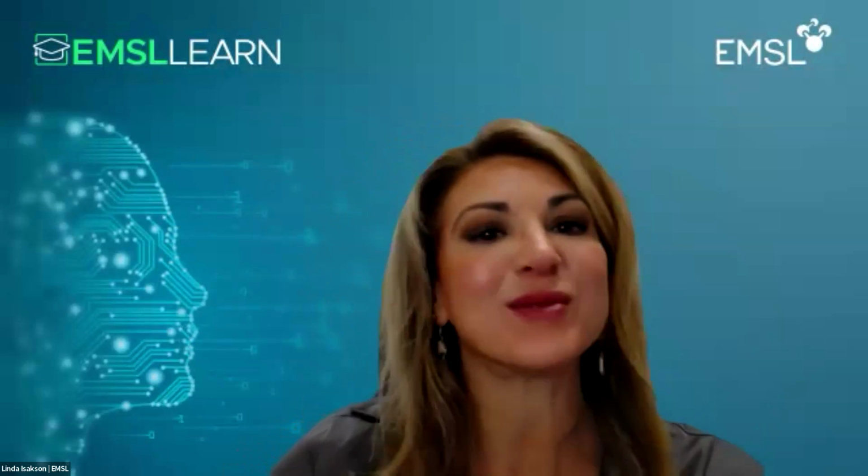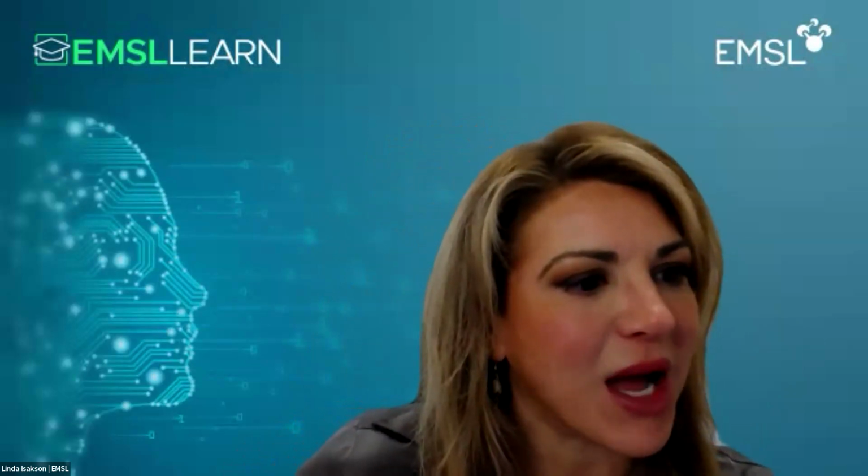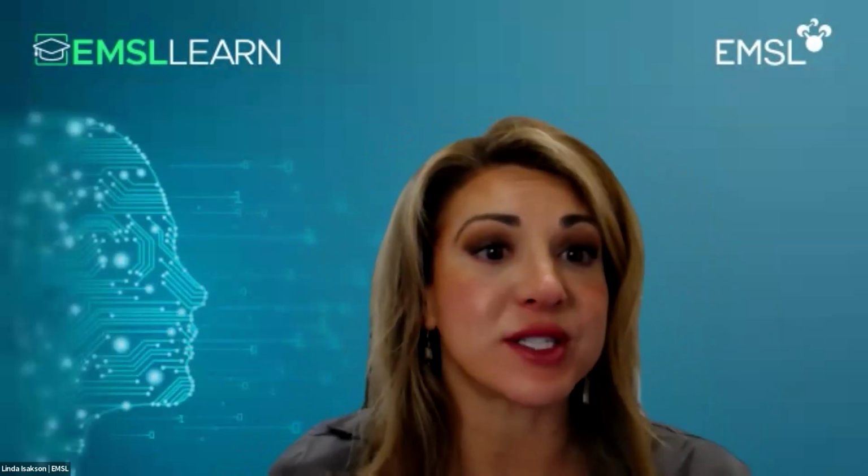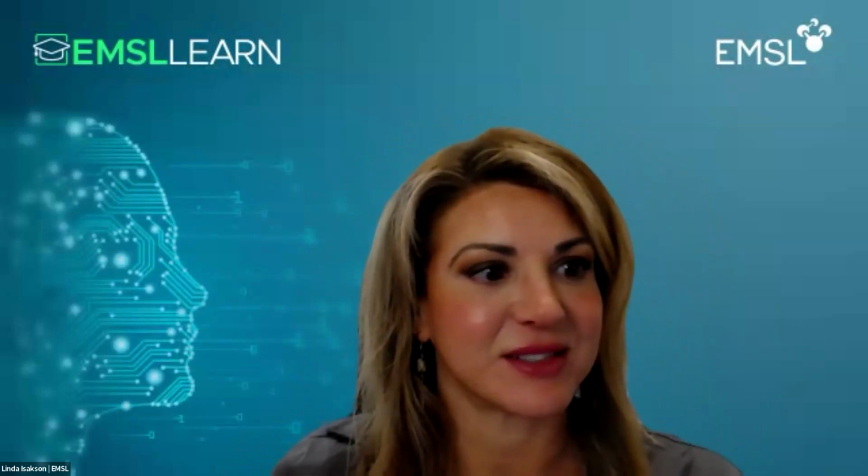Anonymous attendee is also asking how the run rate differs for the high resolution mode versus the survey scan. That's a good question. It varies, depending on how much of each element is present in the sample. If you have a lot of carbon, then we don't need to run high resolution that long. The rule of thumb is that for the low resolution mode we run, say, 5 scans, and for high resolution we run 20 to 25 scans with a different analyzer condition.